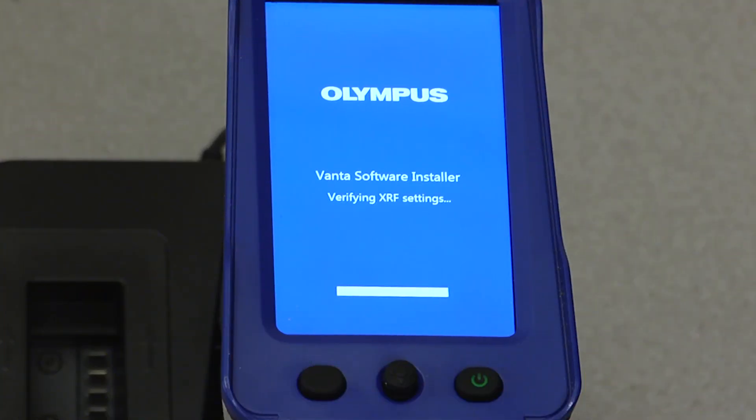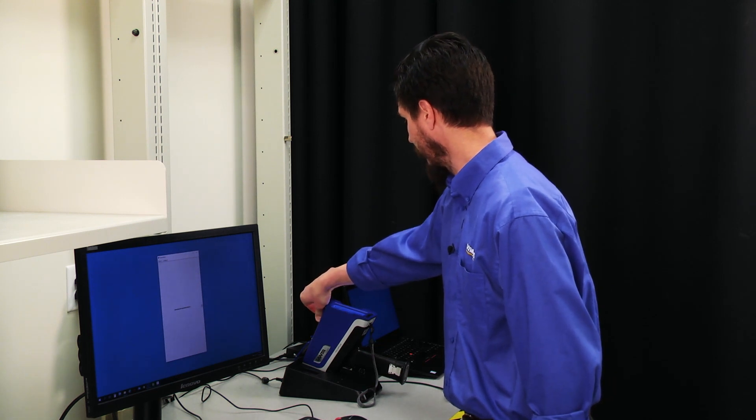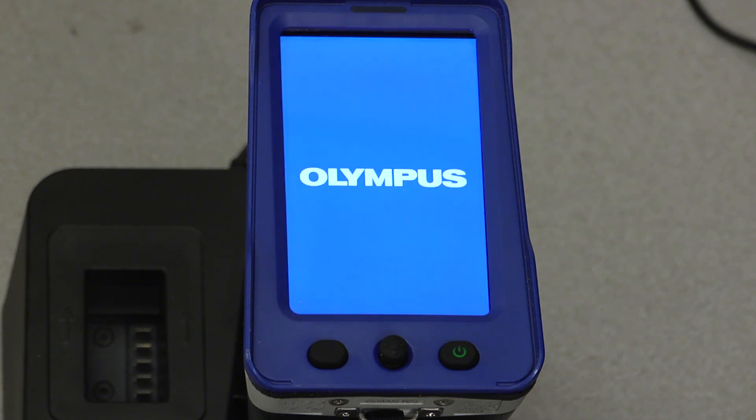After the software has been downloaded and installed on the instrument, you'll see that the instrument prompts you to remove the USB stick to complete the update. So at this point, I'll remove the USB stick. After this, the Vanta will go black. The screen may flash, but this is normal.